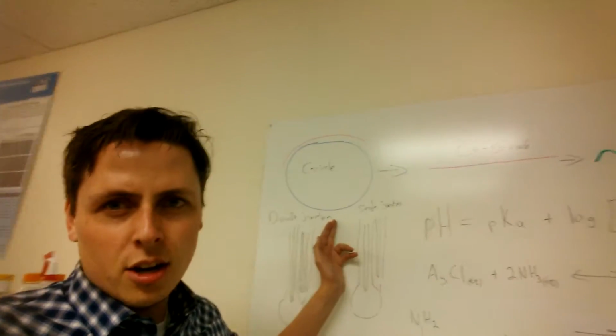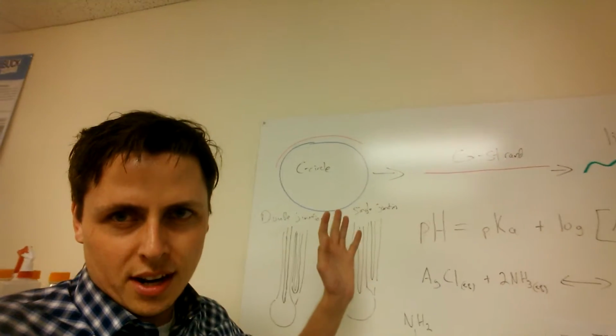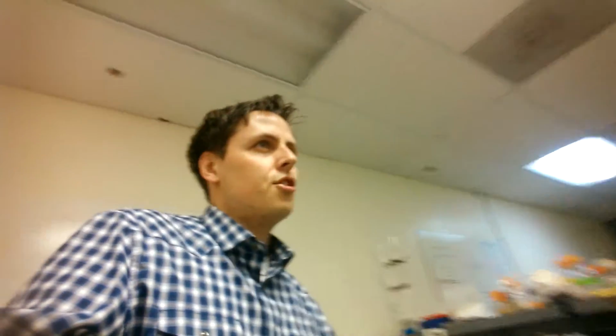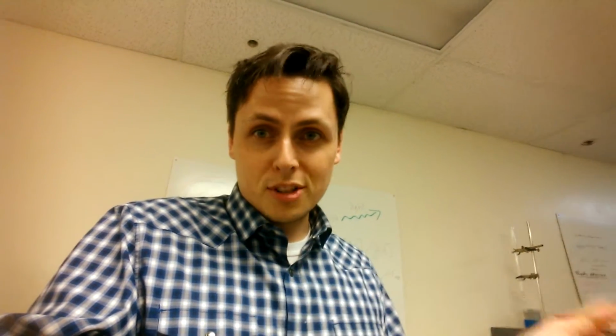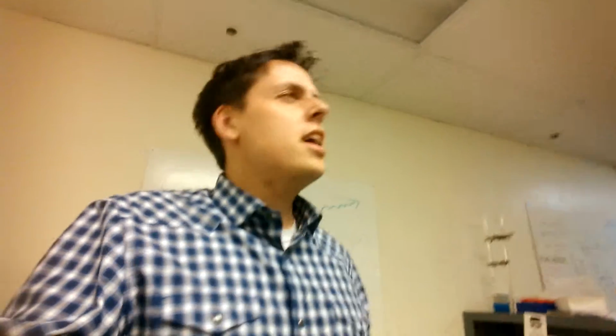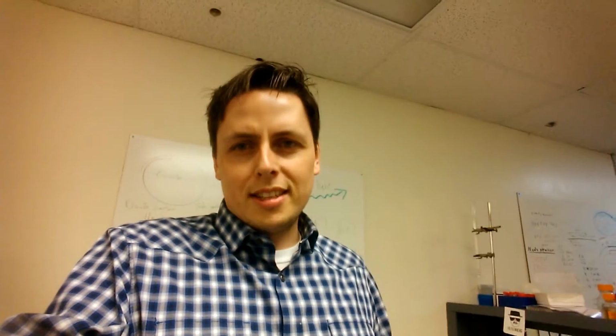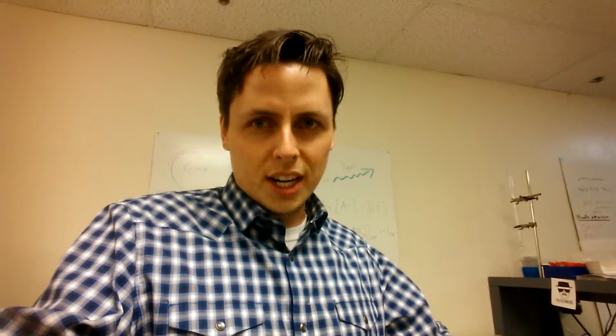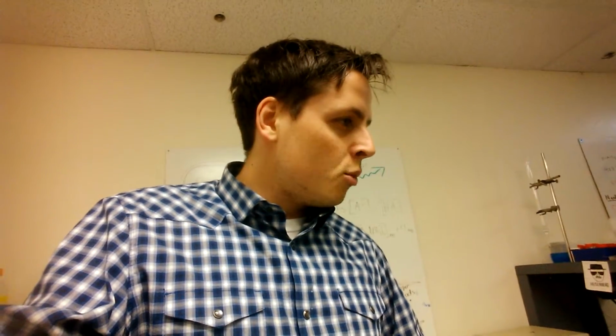This reaction here requires a polymerase to do the bulk of the work. Now, polymerases need a specific amount of salt, a temperature, a pH. There's an ideal condition to make them work properly. The same way that I need a proper temperature. I work fine at room temperature, but if you put me in Antarctica, I will freeze to death. The same kind of thing's going on with the polymerase. It wasn't at the right pH, so it wasn't working. So all that time wasted because I didn't know that unique bit of chemistry.